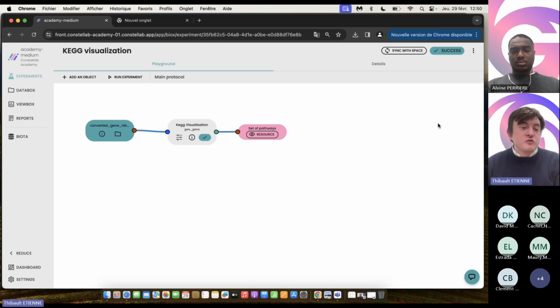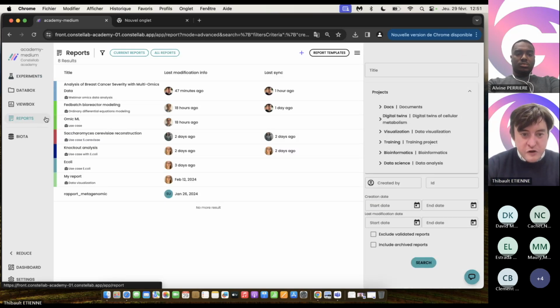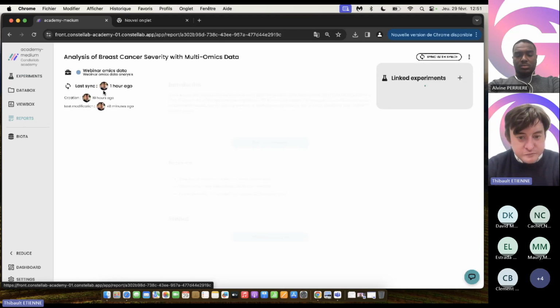Now I want to create a report. In this report, I want to explain my results, and I want to connect the results obtained in the experiments to produce a report. If I go here, we have different types of reports, but for example, this report is for this webinar.